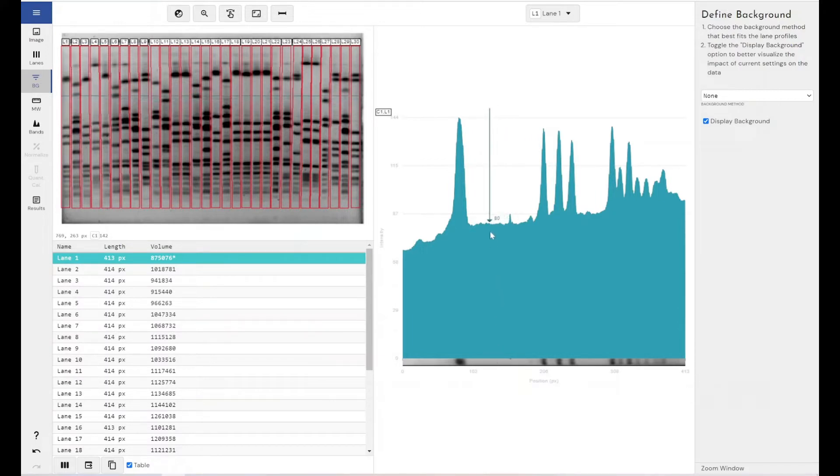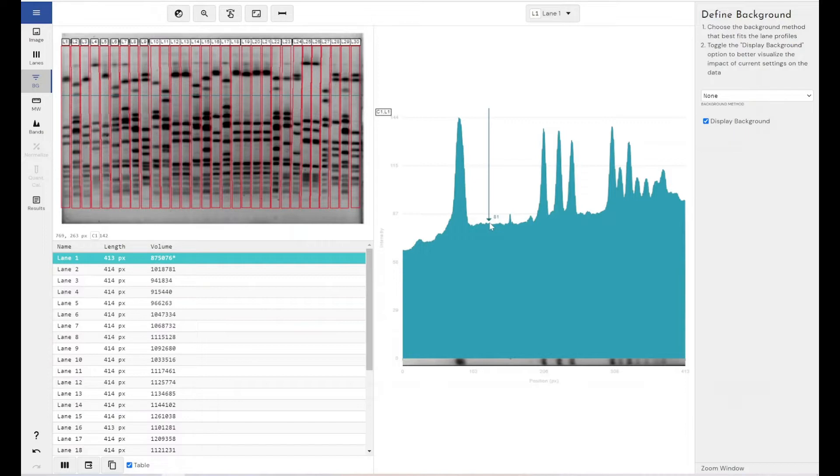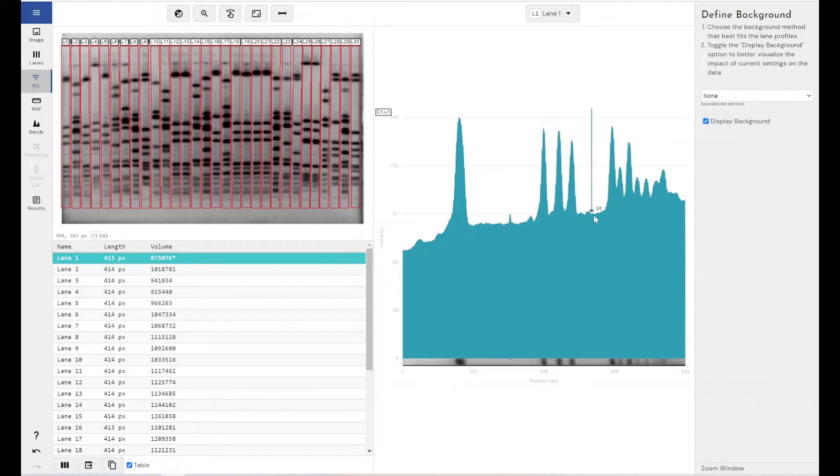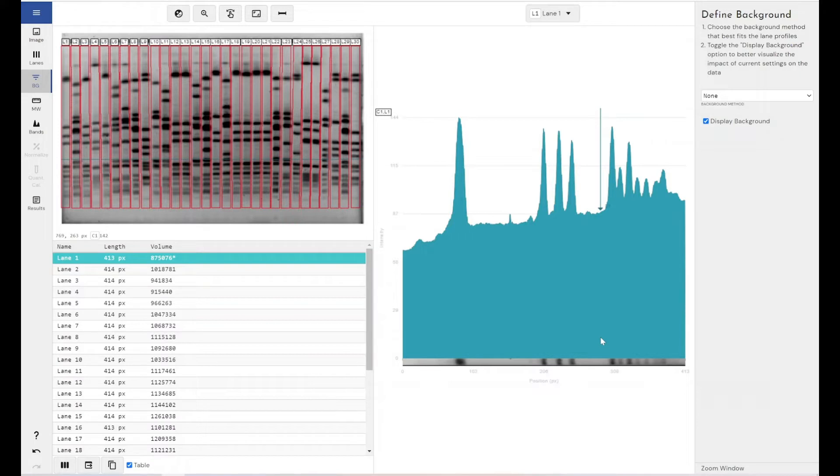However, if we applied a background removal method at an intensity of, say, 81, so we removed all of the values below 81 from our analysis, we would actually be losing these two small peaks here, which might be of interest to the researcher. But we'd also still be including these areas here, which again are slightly darker grey areas of background within our image.